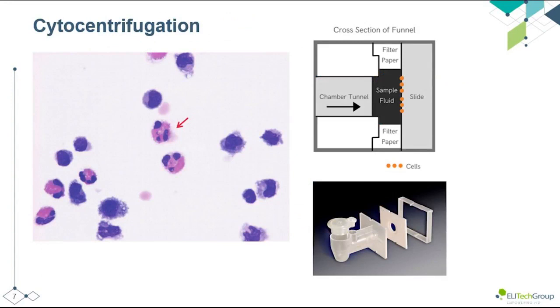While talking about body fluids, we should note that many of the fluids that are tested in a laboratory will have a very low cellular concentration. Instead of hunting around a slide all day for the few cells that may be there, most laboratories will perform a cytocentrifugation of the sample.